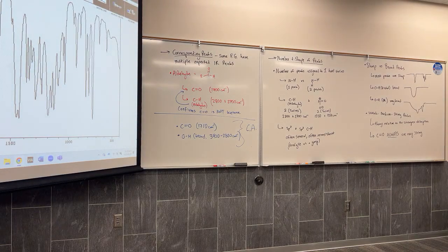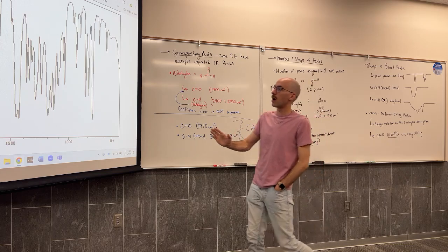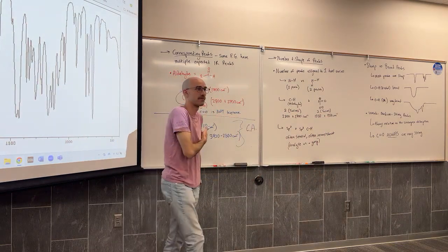And remember, experimental spectra are messy sometimes, so you've got to be able to give some hand waviness to it. Feel free to work together, by the way, especially if not all of you have a correlation table pulled up. Work together, point things out to each other, see how many peaks above 1500 you can assign to their bond type.